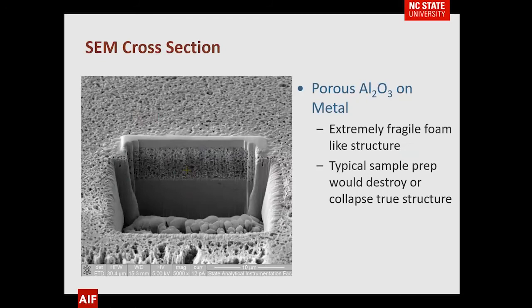This gives you an idea of what something like that provides. The frosting you're seeing is redeposition, which occurs because ions hitting here deposit some material there. There is a protective platinum layer. In this case we're looking at a porous alumina on metal — it's very fragile and if you tried to analyze it with normal polishing you would destroy it. From this you can tell how thick the layer is, that it's porous, and that the porosity is fairly similar from top to bottom.